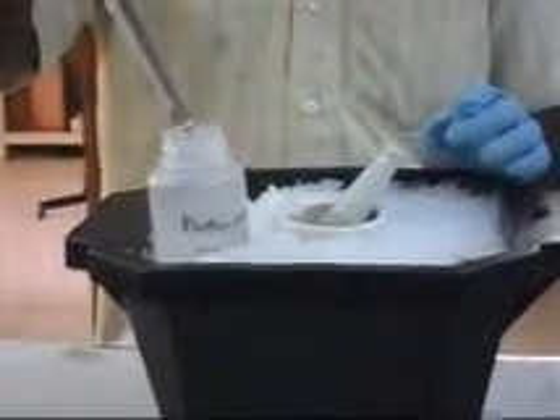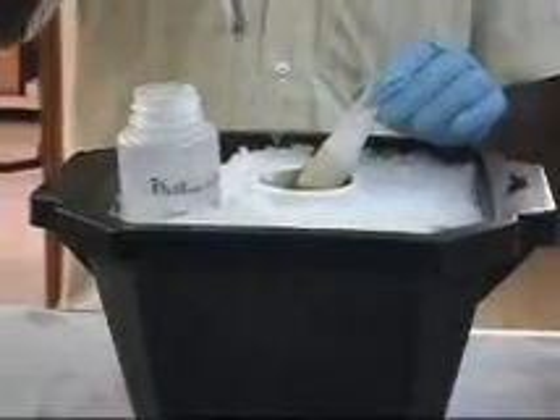The fresh leaf samples are ground in a porcelain mortar with the help of a phosphate buffer. The ground samples are then transferred into a new Eppendorf tube.